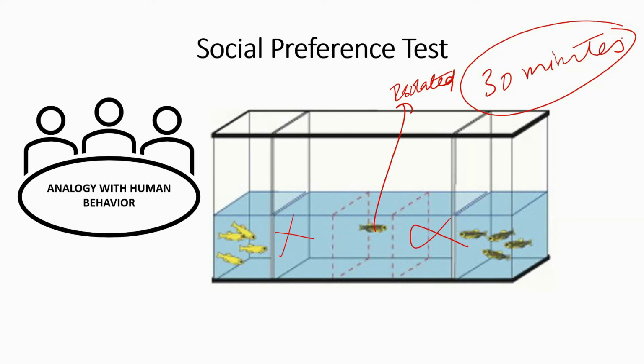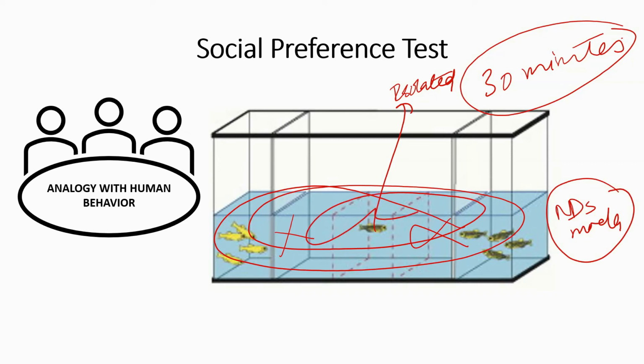So if you are learning something about social preferences or doing something in this area, this is an excellent model. This is an excellent model. So if you're working with a dementia model, for example, a neurodegenerative disorders model, you will see that your fish is just fine. If somebody is coming, meeting, it's okay. If somebody is not coming, it's okay. It will move around everywhere. You will see that the fish is not taking part in the shoaling movements or something. It's just freely flowing everywhere. So as far as the neurodegenerative model goes, they flow freely everywhere. You just cannot make out anything from them.